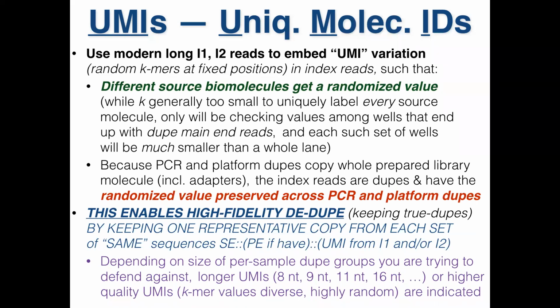If you're making a controlled oligo, then when it comes time for the 5th base, and the 5th base for oligo number 12 needs to be a C, you take your tube of Cs and add that and incorporate C. But you could also order it as N. What that means is that you have a tube that's got all the nucleotides in it. Then when you put that on with the terminator, individual copies will incorporate a random base. So now your tube becomes a mixture of sequences that are variable at that position.